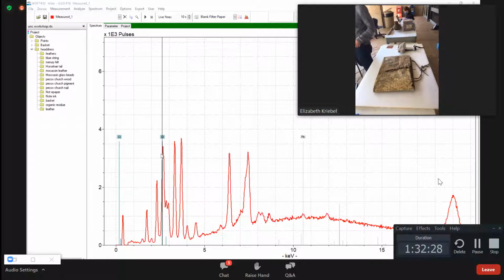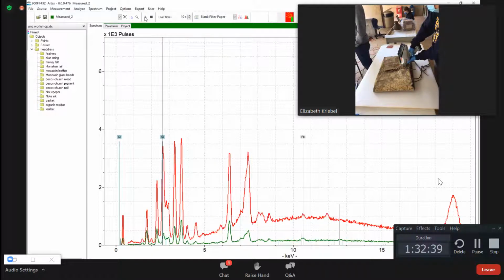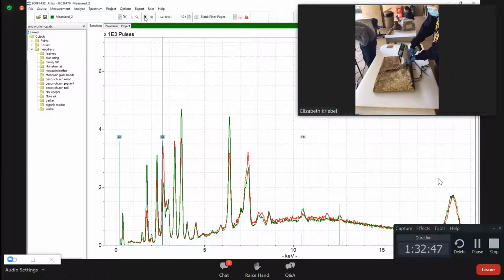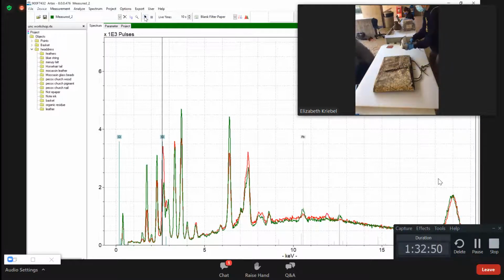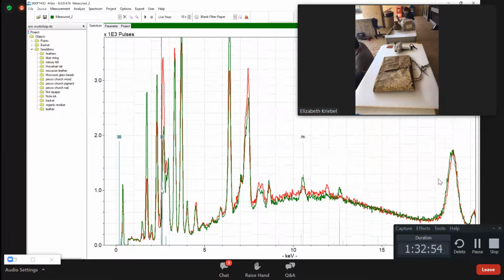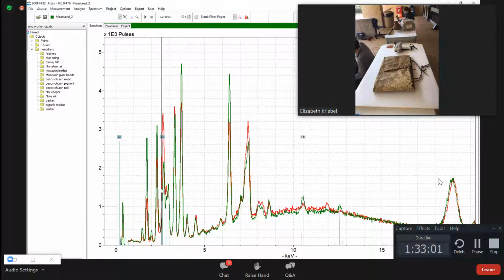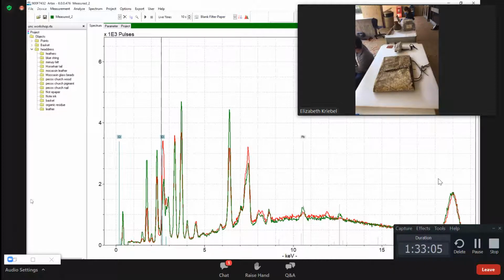All right, let's try the blue pigment. That's the one that really jumps out at me. And let me know when you're ready. I'm ready. All right, starting. All right, so for the blue pigment, I see a little more lead, but I don't really have a clear read on magnesium, but I do see a lot of aluminum and silicon. My guess would be ultramarine again. All right, let's add those two over here. And then this is blue pigment.